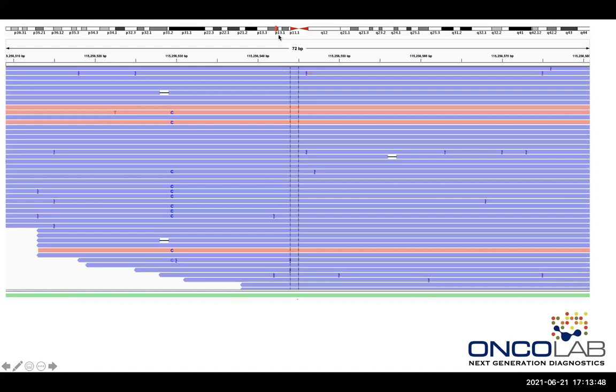And you can see this is a chromosome P13.1. I think this is chromosome 1, but I'm not sure. And you have all these sequences that aligned, and you'll see at the bottom here, some of the sequences are cut off, and that's where they ended. So one tries to find the best fit. There are also these little spaces where a sequence wouldn't align, and then this shows you some nucleotide changes in the sequence as well.